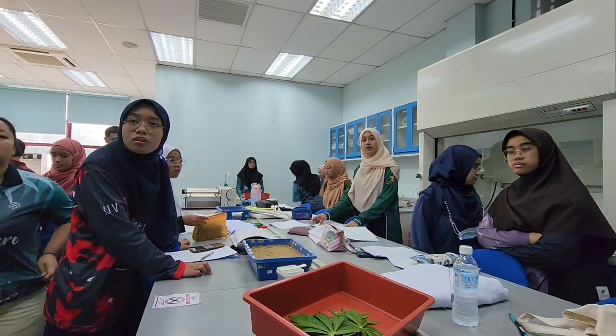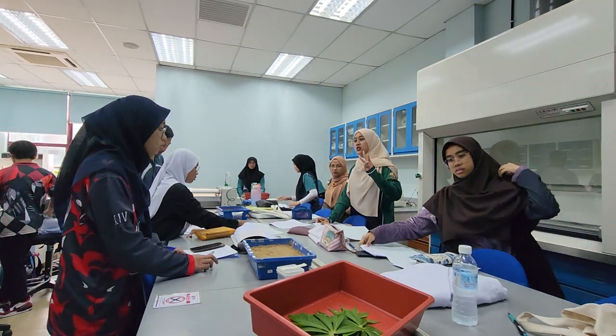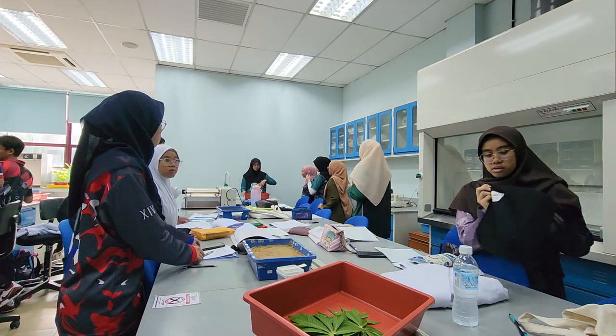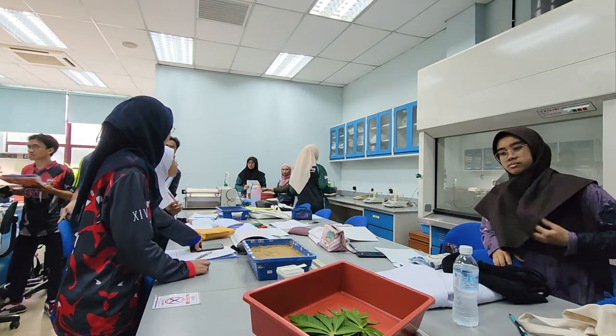I suggest each person at least do one leaf so that everybody gets experience. Okay? Get your tracing paper, graph paper.